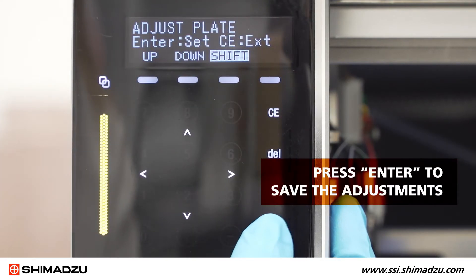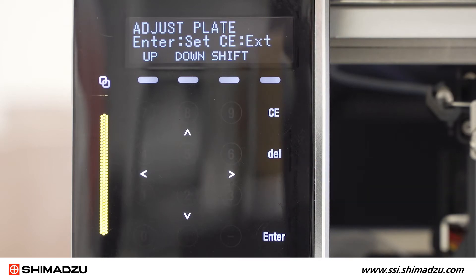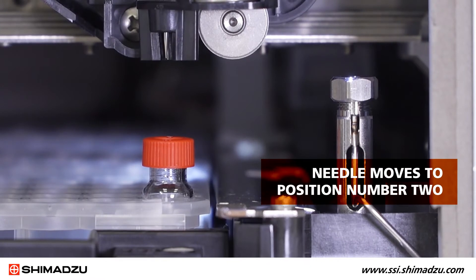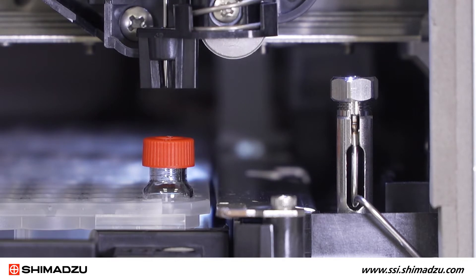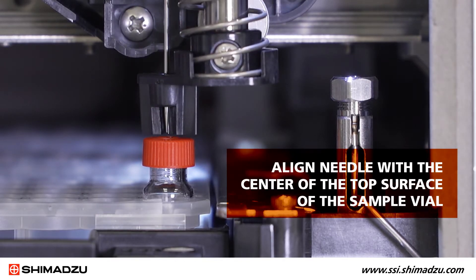Once the needle is aligned, press enter to save the adjustments. The teaching procedure is now complete for position number one and the needle should move to position number two at the front right corner on the front plate. Adjust the needle position as before using the operation keys and align the needle with the center of the top surface of the sample vial.